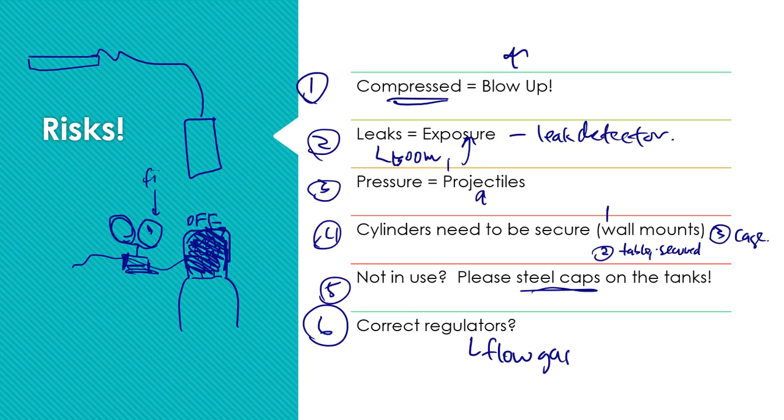And this is like the fuel tank of your vehicle. So when you add gas into your car, the floater inside the gas tank makes that needle go up or float down when you're getting empty. And we need something on these tanks that tells us if they're full or if they're empty, or how much gas is left over at least. So one of the dials that I see on the regulator will be the fuel tank side, right? How much is actually present.